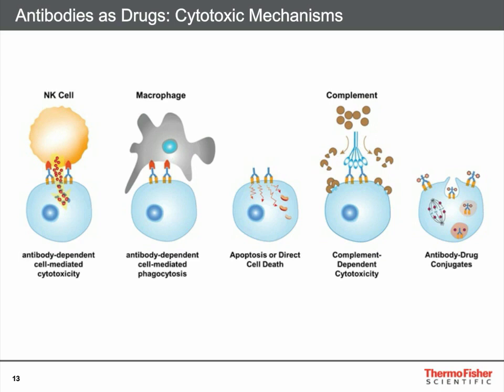So I'll show you how we analyze and screen for these different parameters using flow cytometry.